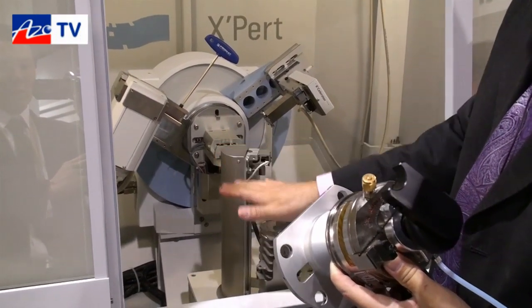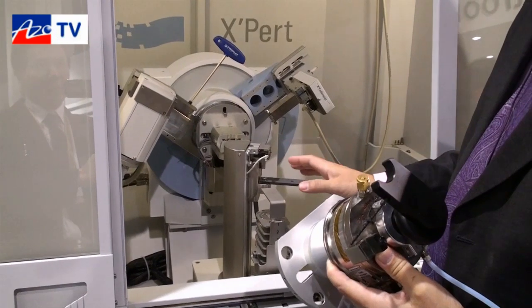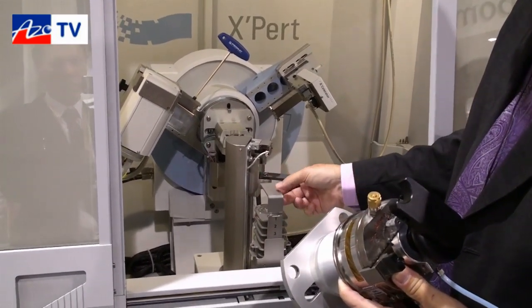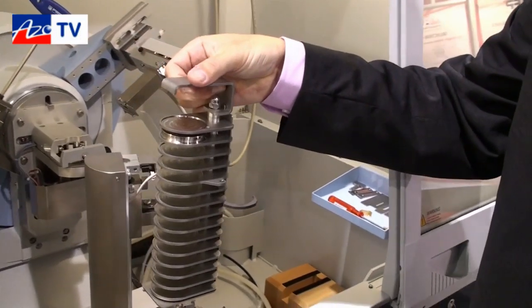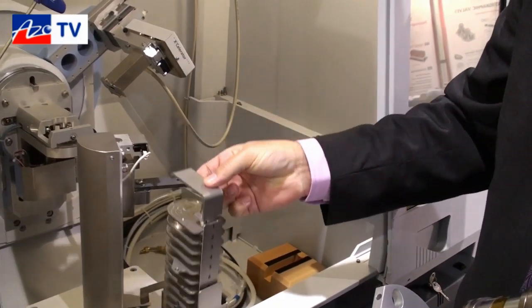The sample changer comes in a 15-position or 45-position configuration, depending on the number of trays, and these simply come out of the changer magazine as well, so remounting things becomes quite easy.